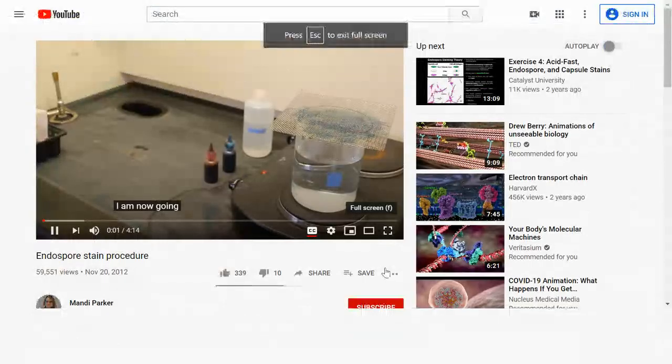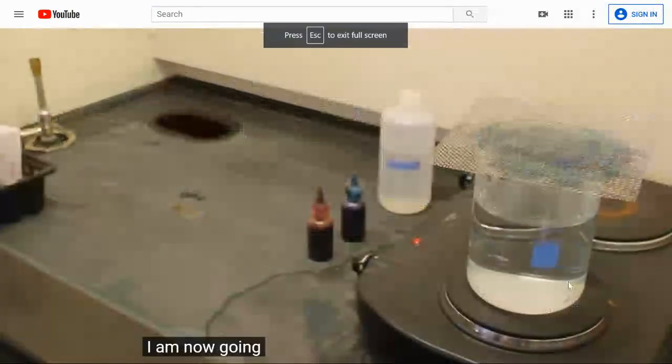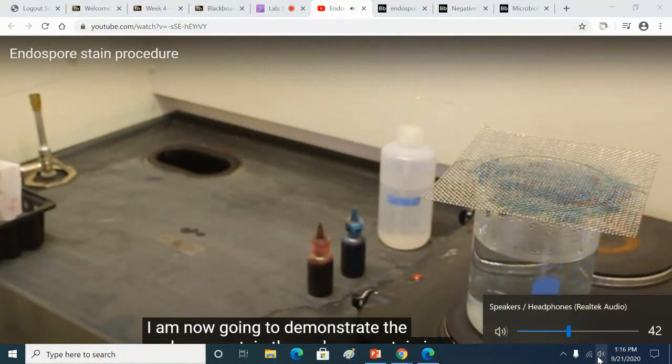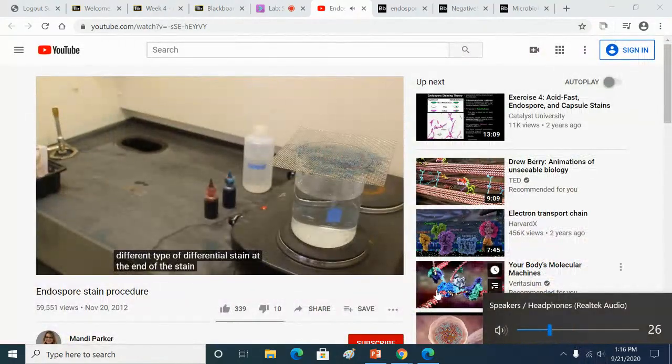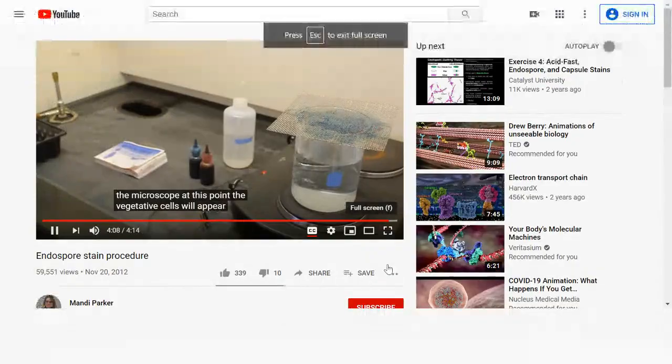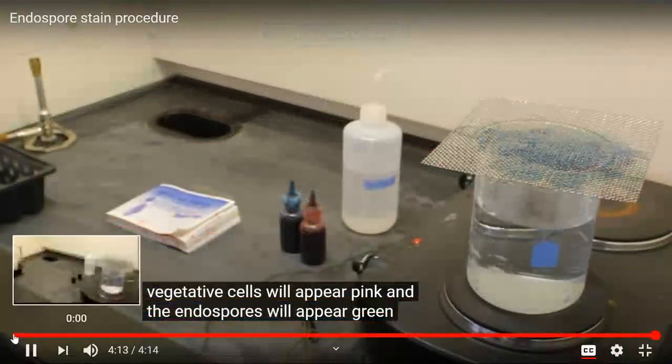I am now going to demonstrate the endospore stain. The endospore stain is a different type of differential stain. At the end of this stain, you will be at this point, the vegetative cells will appear pink and the endospores will appear green. Start that over.